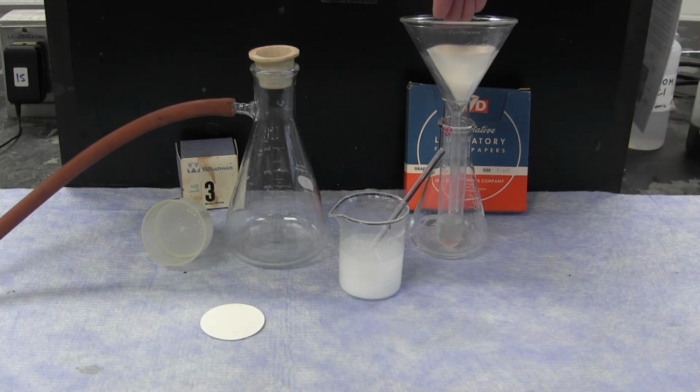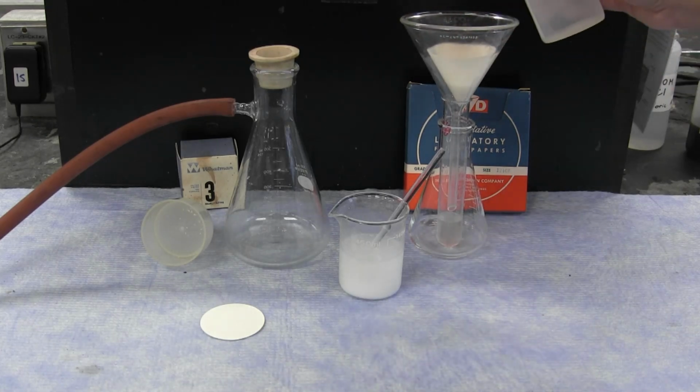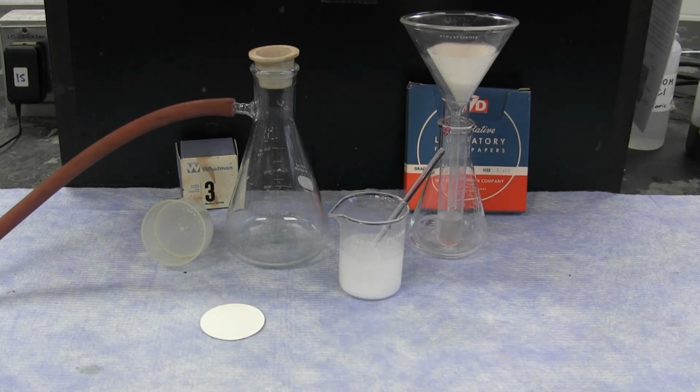Likewise, the precipitate on top could also be analyzed, and in future laboratory courses, the precipitate on top may also need to be washed with water to make sure all of the liquid is gone and only the solid, the clean solid, remains on top.